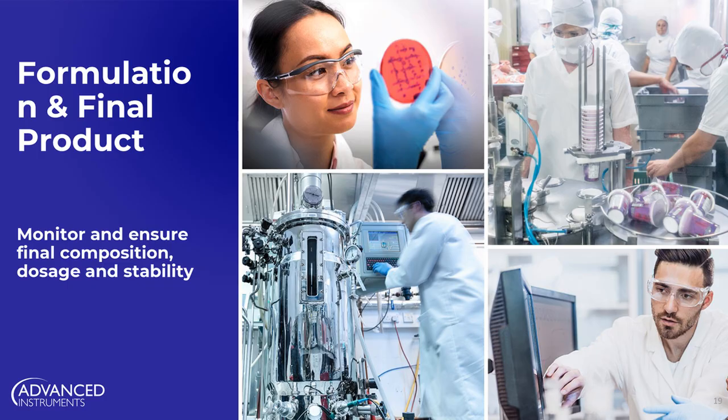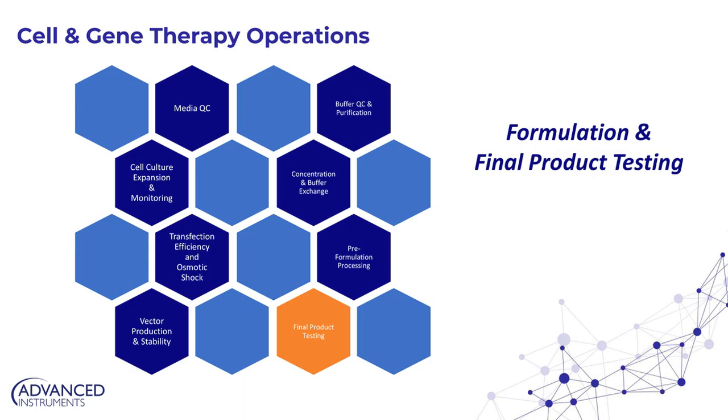All right, so next we have formulation and final product testing. And really, it looks like some of you are doing osmolality testing. I'm assuming most of you are doing the compendial testing for release for osmolality testing.